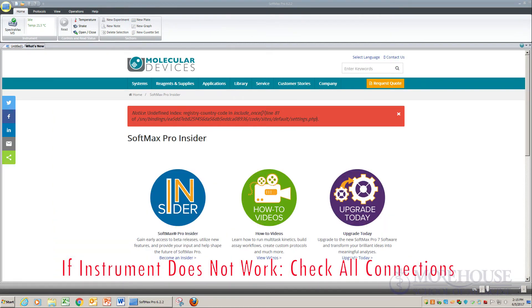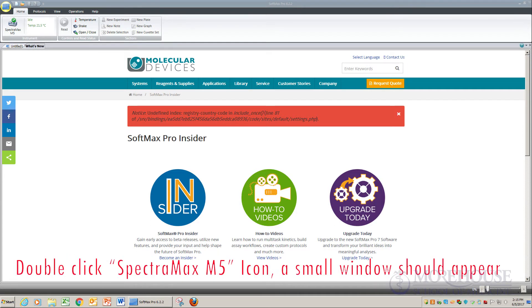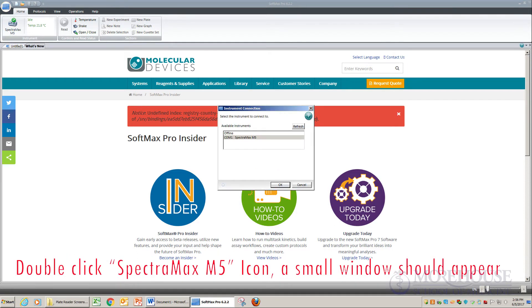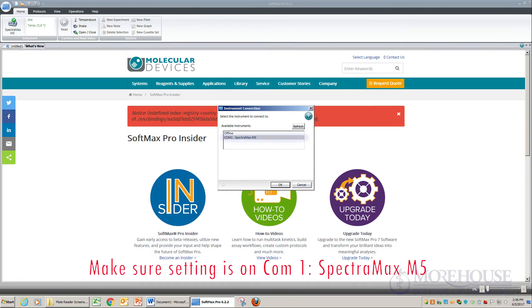If the instrument does not work, check all connections and follow these steps: double-click the SpectraMax M5 icon. A small new window should appear. Make sure the setting is correct.